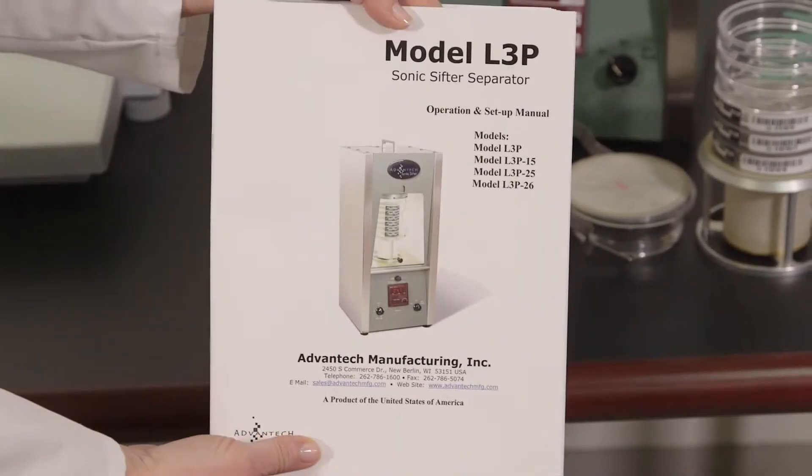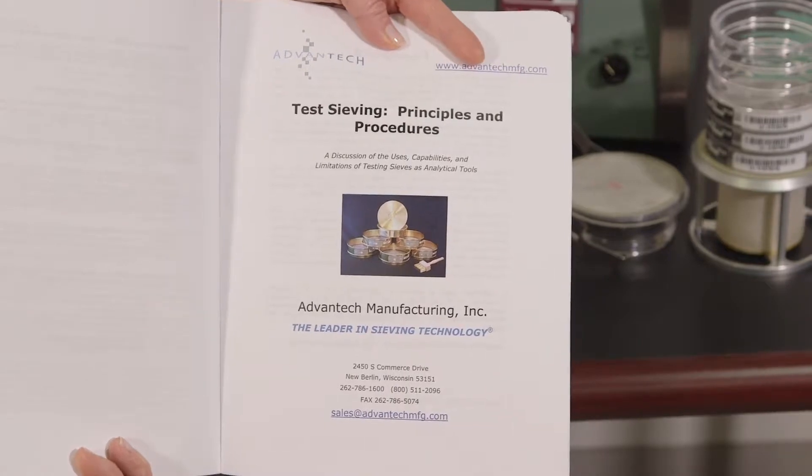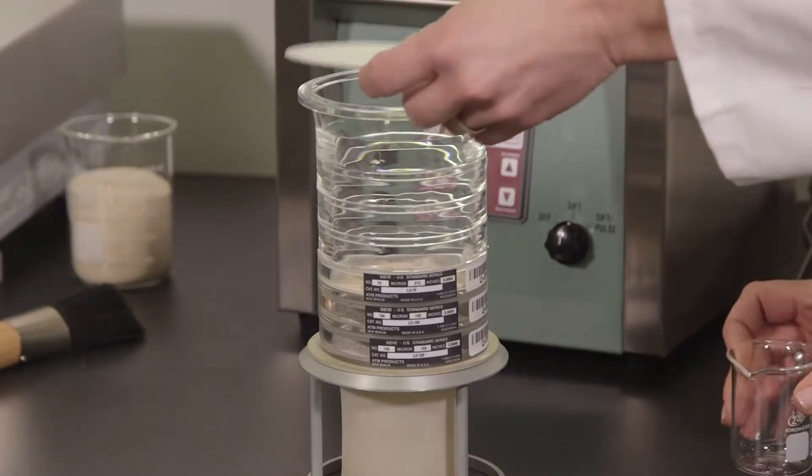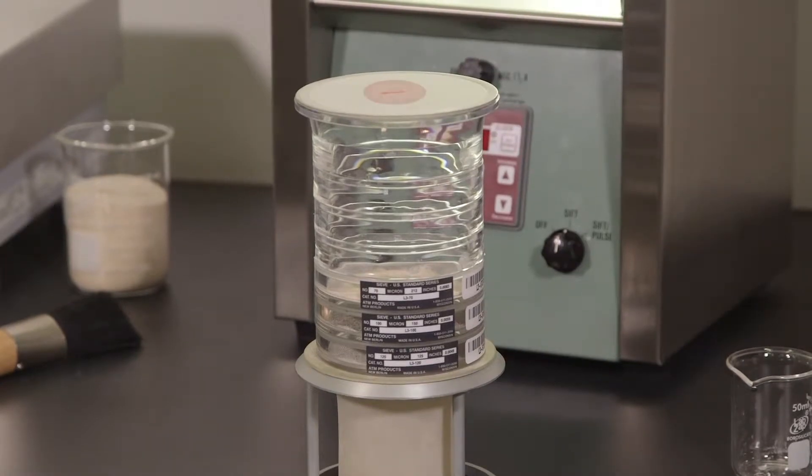Generally speaking, a smaller sample is better. Large samples will overcrowd the sieve and lead to blinding. Large samples may also yield inaccurate results, as not all particles will have equal opportunity to be passed or retained by the wire cloth openings.